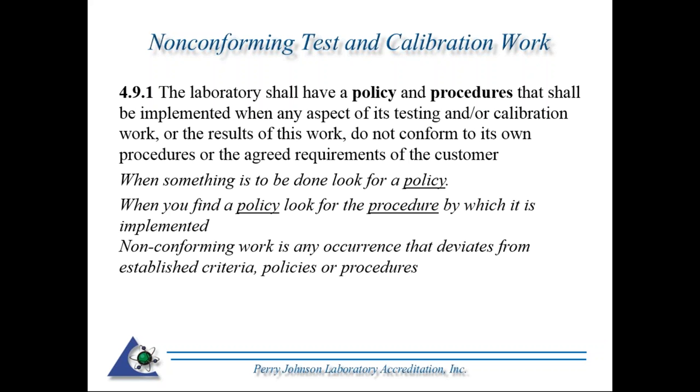So basically, what's currently in the committee draft is you have to have a procedure, and the procedure has to ensure, and basically all the requirements in 2005 are in the proposed 2017 version. So if you're transitioning, or a new lab coming on board, whatever I'm going through here in regards to non-conforming calibration and testing work appears to be crosswalked over to the new standard. So we're in 2005 now. Again, my disclaimer regarding the upcoming revision is that it's not a final document yet. It's still going through the review and approval process, and things are subject to change.